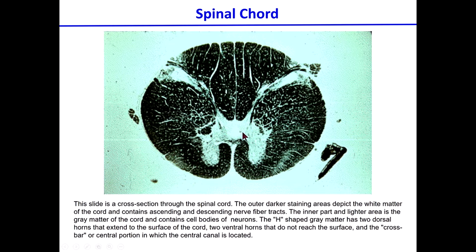So when you look at histology slides, one of the things that you try to identify is how the stain was performed. Otherwise, if you are not familiar with the structure, you're going to have some problems. But despite the peculiarities of this particular stain, structurally speaking, we see what we needed to see.